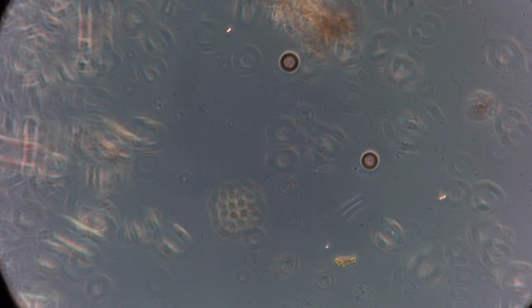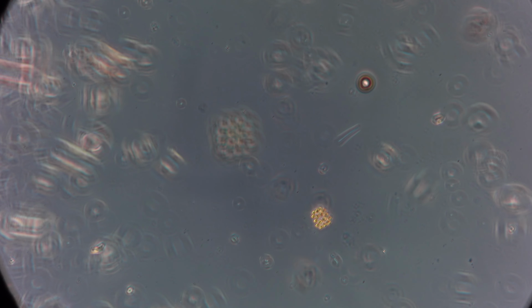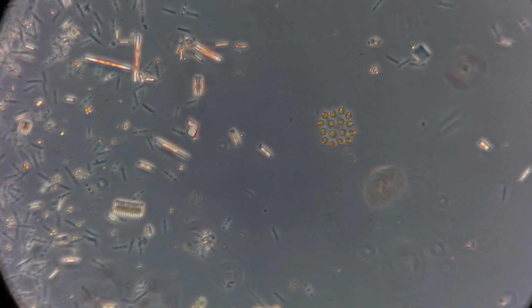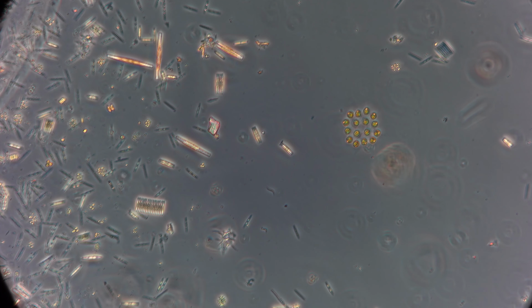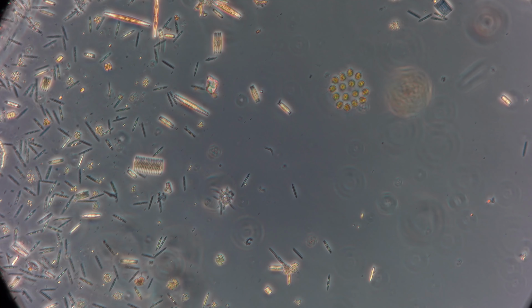What are air bubbles? Oh, okay. It's kind of cool though. Now I'm recording this, so it'll also record our voices. Oh, that's so cool. This is kind of a cool diatom. So the diatom is what you said. It has a glass structure around it. Ooh, there's an amoeba.